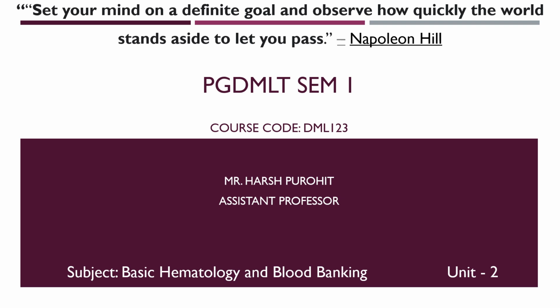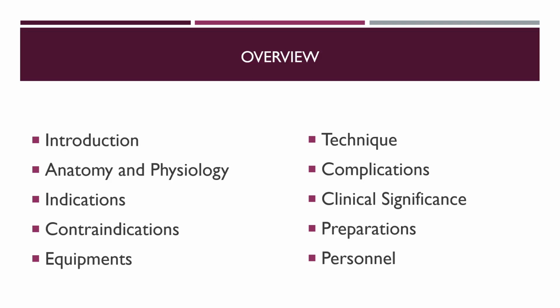So, dear all students, welcome to Unit 2. In this lecture, we are going to see bone marrow aspiration cytology, and let's discuss more about bone marrow. We are going to see what bone marrow is and how the aspiration cytology works.